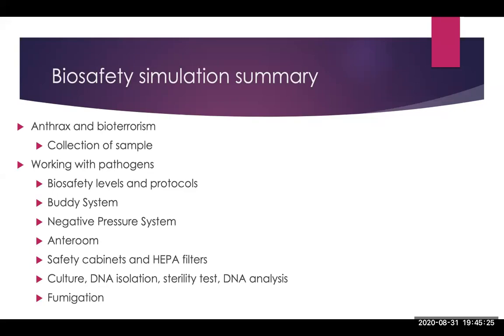Okay, so now we're going to start the actual little lab intro, very brief. I'm not going to intro the demo, right? That's just how to use Labster. You can do that on your own. But for the biosafety, I already mentioned it's a heavy lab. It's big, 3 hours. And it's going to talk to you. It's not going to really introduce anthrax before it starts asking you questions. So I'm going to tell you a little bit about that.